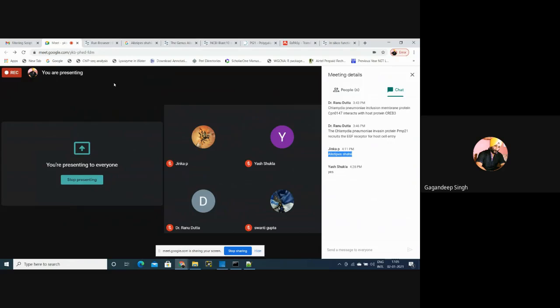Okay, we have to map reads related to the normal condition and reads related to the disease condition. We'll download that data and we'll map those reads from normal and disease condition to our assembled data. Now, if you have any doubt, please ask me because I'm trying hard.